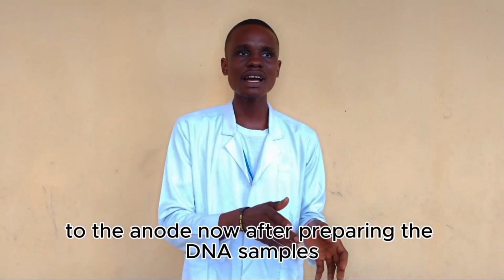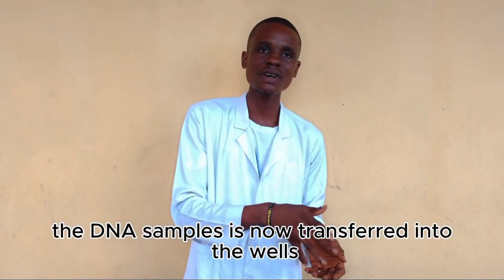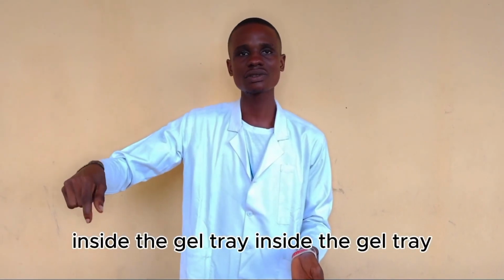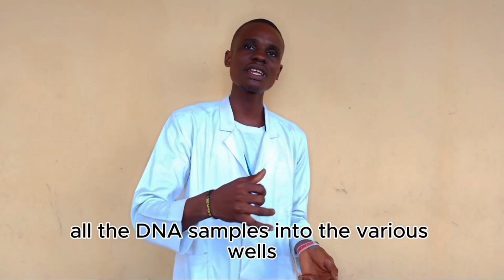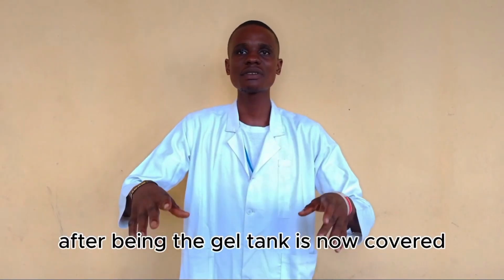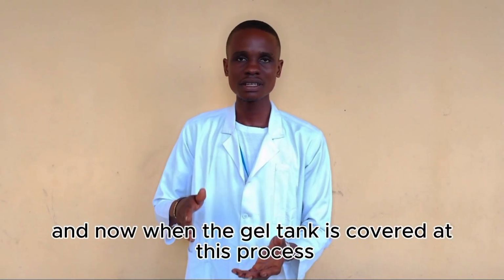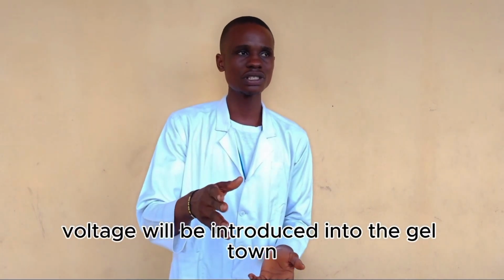Now, after preparing the DNA samples, the DNA samples are transferred into the wells inside the gel tray, and this is done by the use of pipettes. After pipetting all the DNA samples into the various wells in the gel tray, the gel tank is covered.